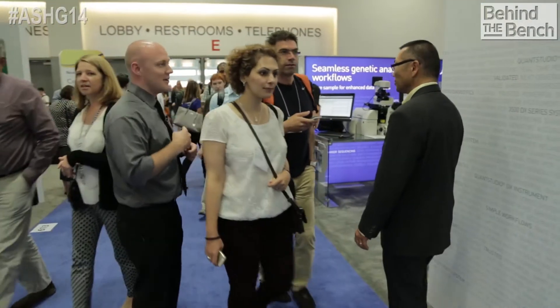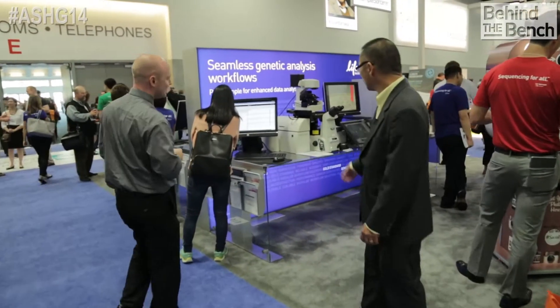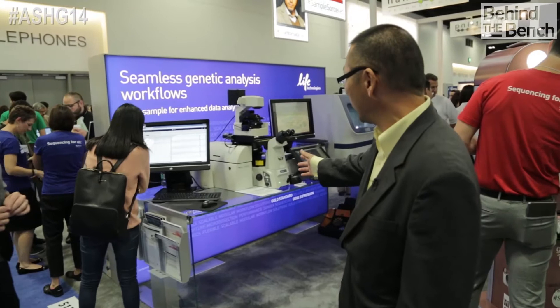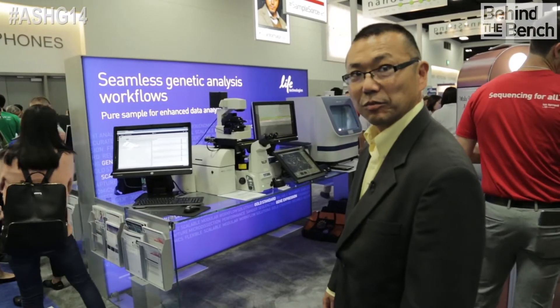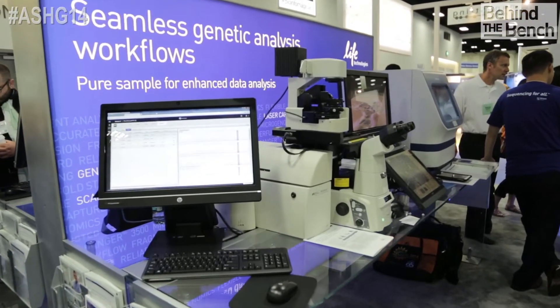Let's move over to the laser capture microdissection area. Here we're highlighting laser capture microdissection — we've got the Arcturus system for pre-analytical sample prep, to remove cells that you don't want from the cells that you do.